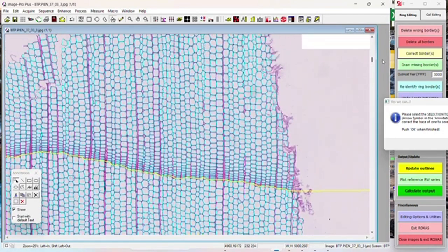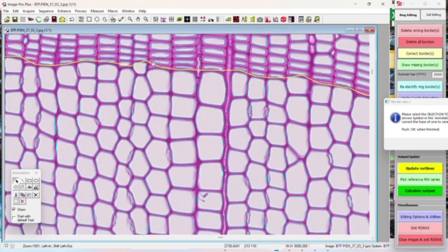So not a lot to edit. It doesn't have to be absolutely perfect, but if you see something like that, which is not going to be that extreme, just make sure these little spikes aren't a lot of them, or that most of them are corrected.